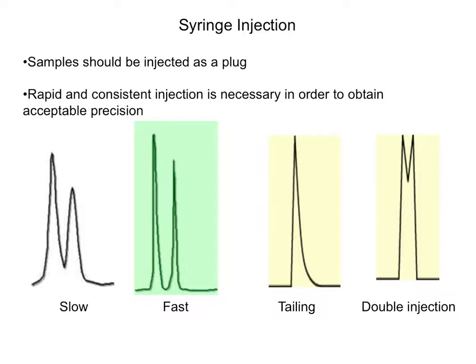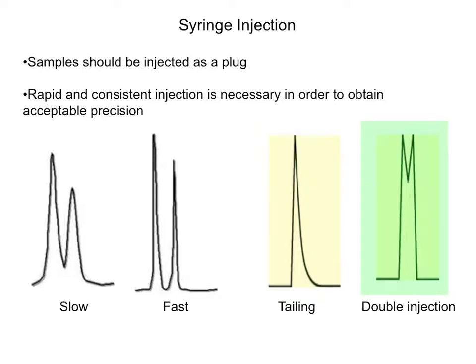Peaks can also exhibit tailing, such as the third peak. This occurs when you inject too much material, causing the sample to spread out in the column. Finally, if you stutter during the injection, you are effectively double-injecting and will get extra peaks. The last diagram illustrates this effect.